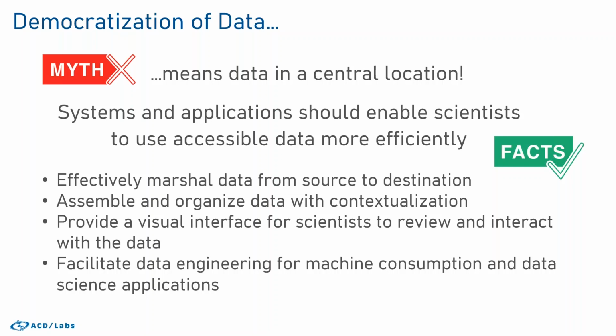They want to possibly reprocess the data. And having one interface to reprocess or process across a number of analytical techniques is something that they would want.